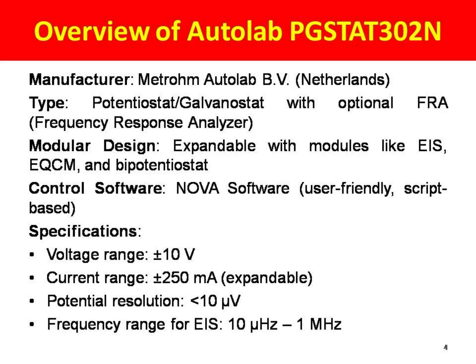The overview of Autolab PGSTAT 302N: the manufacturer is Metrohm Autolab B.V., the Netherlands.